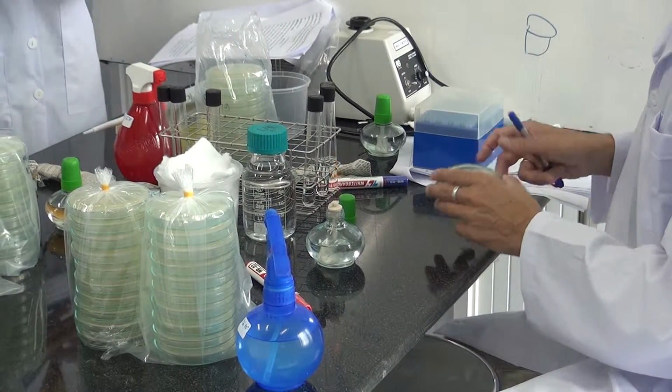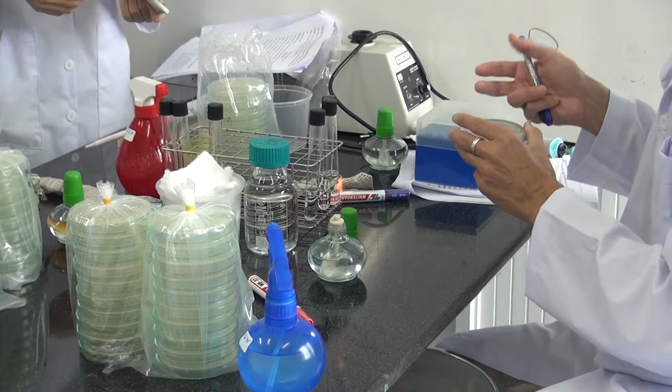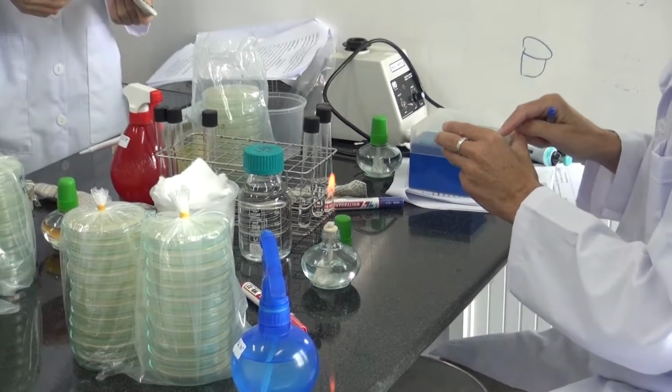And if you have in your incubator plates from different days, because you work every day, also the date should be written.